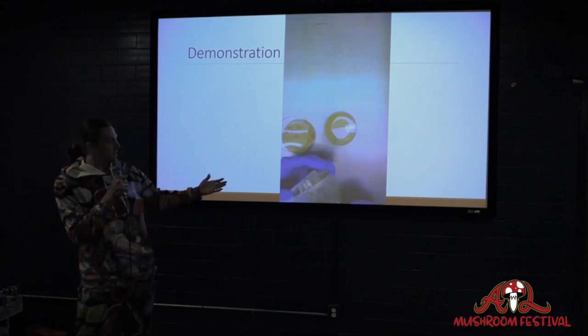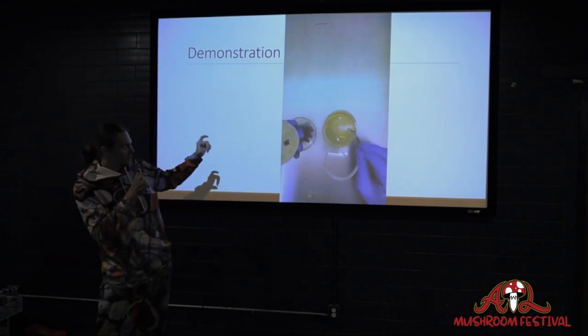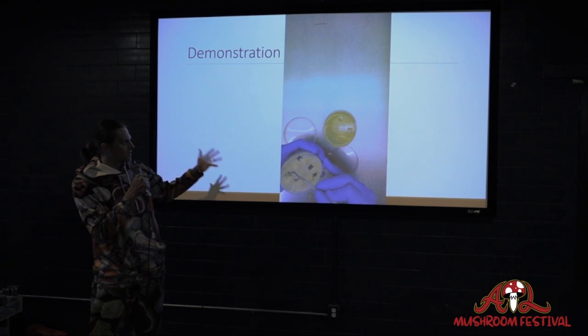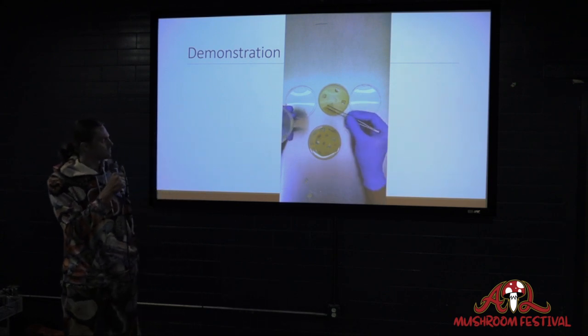So instead of having to have 5 agar plates for this technique, where you would have 4 singles and 1 plate for cover slips, it makes it really incredibly easy to just run them all on the same plate. Which saves you 3 extra agar plates that you don't need to make.